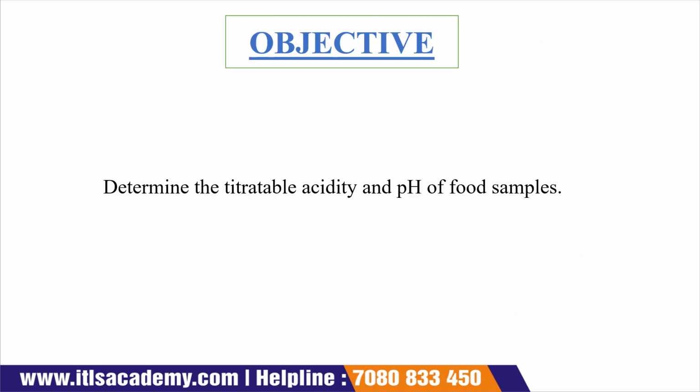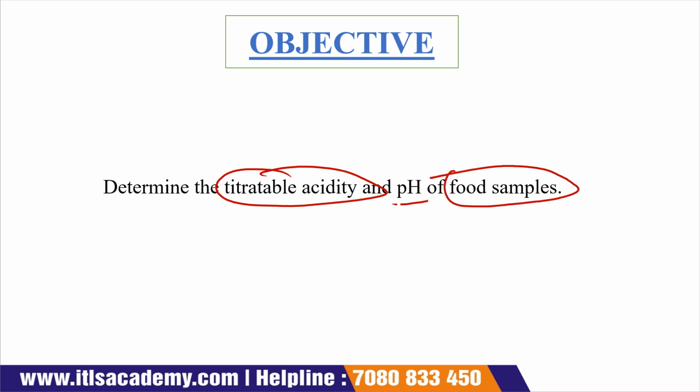Now the next one, objective. Here we have to determine the titratable acidity and pH of a food sample. This is the objective of our experiment.